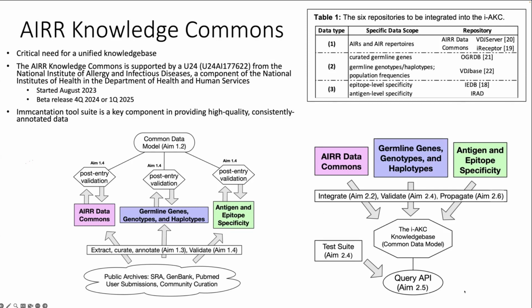And then over in this other figure here, the data will become integrated. What I'm not showing in this figure is that there's going to be things where we add new knowledge as we do this integration. So we'll be doing inferences about receptors and their epitopes and specificity and other types of things, and then making that available in a large knowledge base that you'll be able to query. We'll have a user interface that you can interact with.